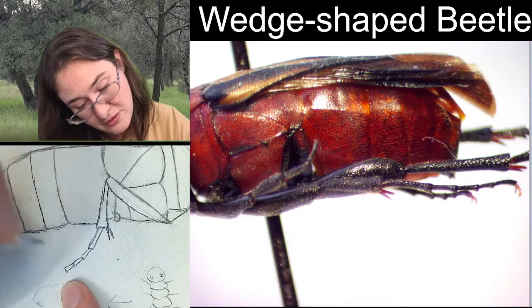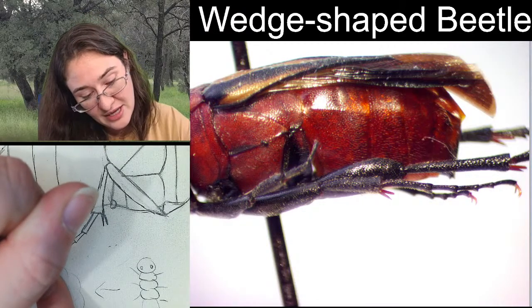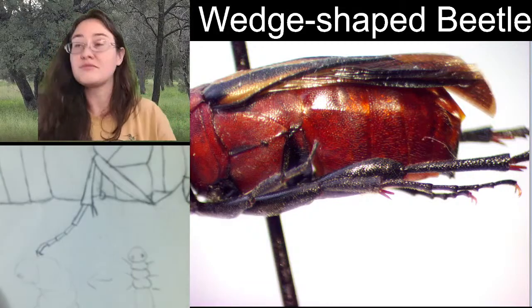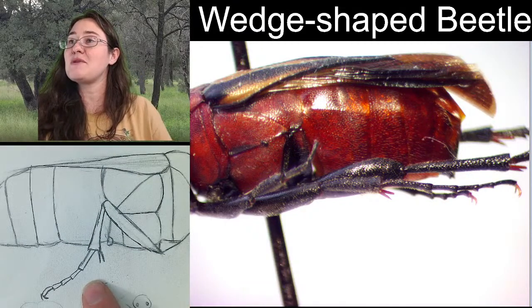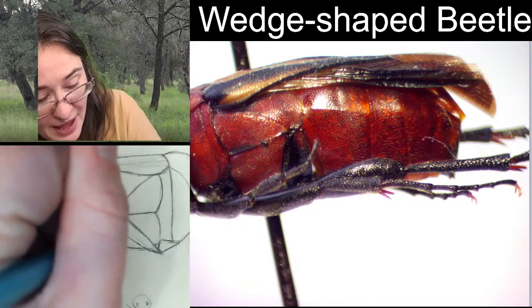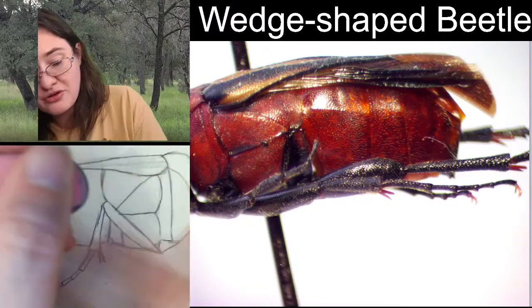1, 2, 3, 4. And then that last one is rounded at the end with the claws. All right, so that is going to be our middle leg, and our hind leg, remember, is connected right here to the back of that hip, to the back of that coxal plate on the thorax.